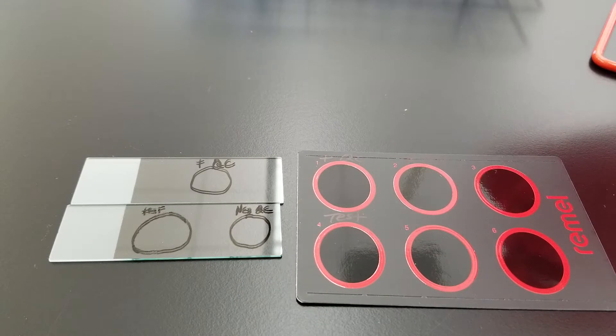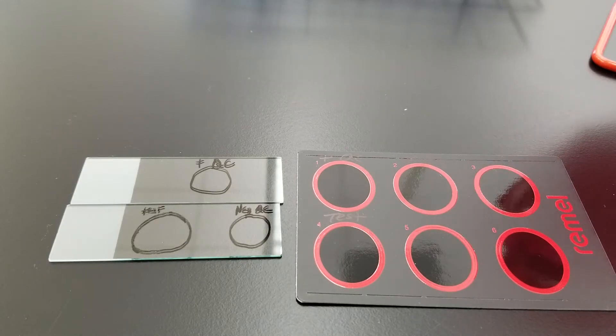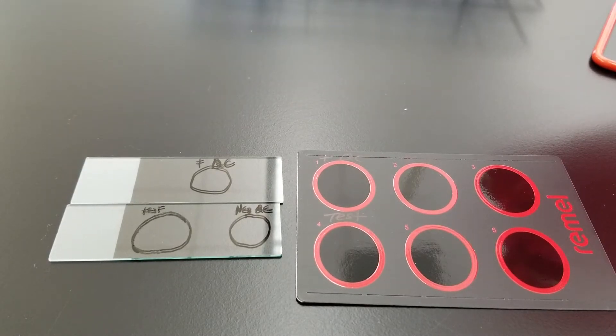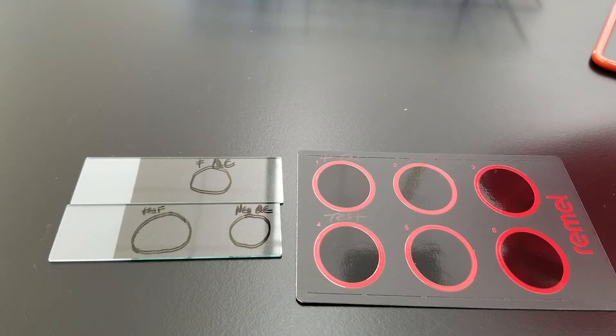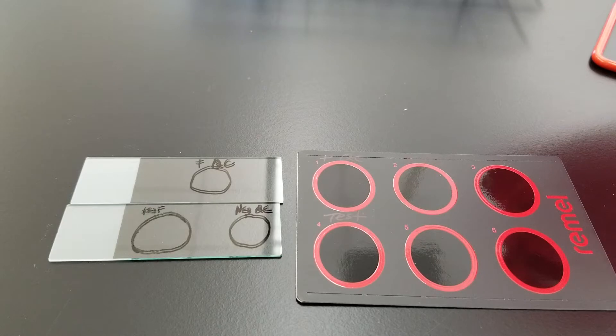Staphylococcus aureus is a gram-positive cocci in pairs, tetrads, and grape-like clusters. It tests catalase positive like so many other bacteria that are out there. So the first thing you want to do is the catalase test. It would be positive and you would have seen the gram stain, so you would already know the gram stain reaction, morphology, and arrangement. And that would lead us then to this test.